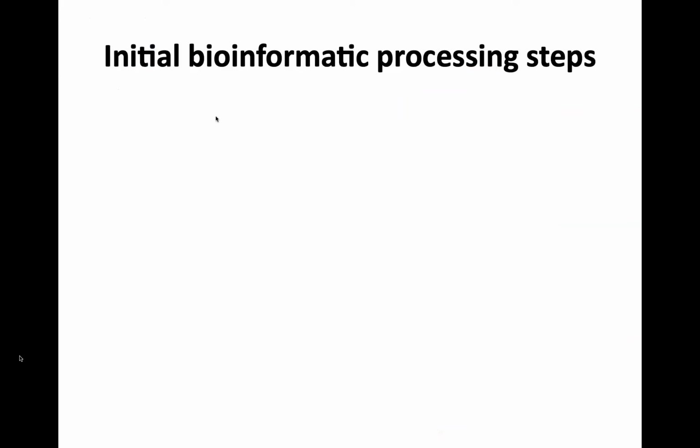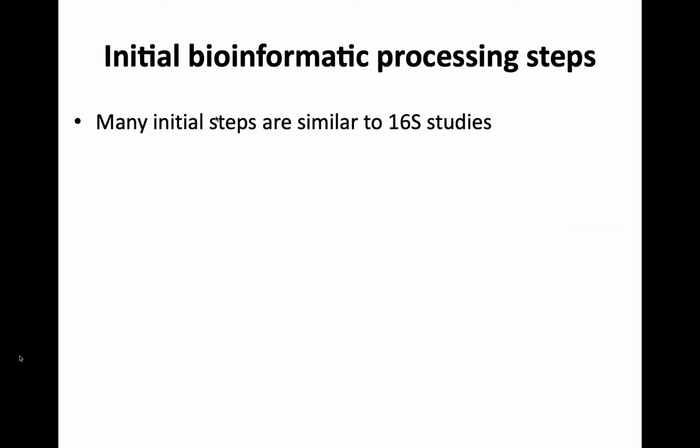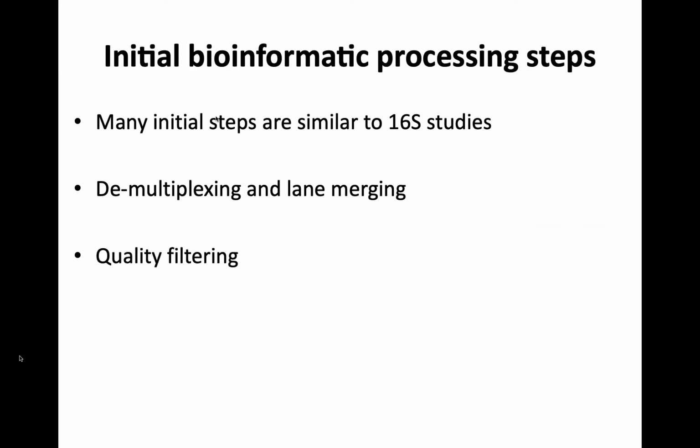All right, so if we come back to bioinformatics steps, let's get into some of the nitty gritty. So if we talk about the initial bioinformatics steps, the nice thing about coming second is a lot of this was covered nicely by Diana and Rod yesterday, is that many of those initial steps are similar to 16S studies, right? So those include things like demultiplexing, lane merging as it comes off the sequencer.